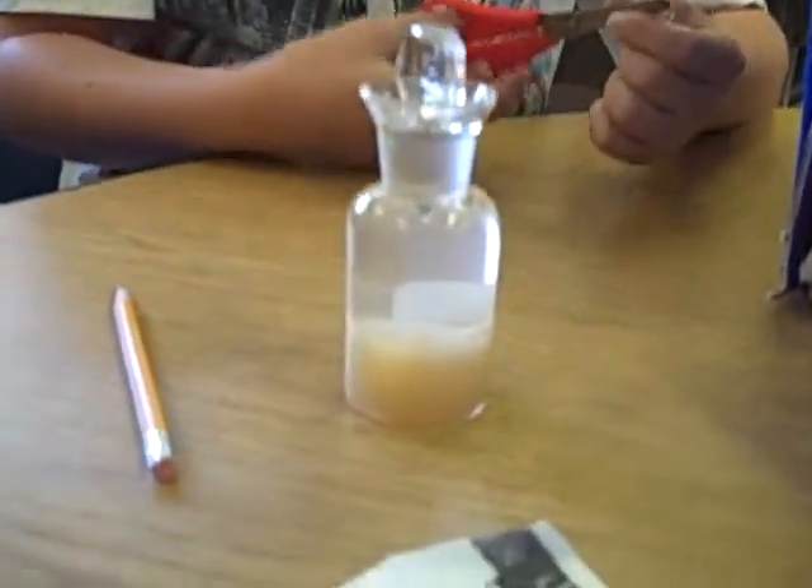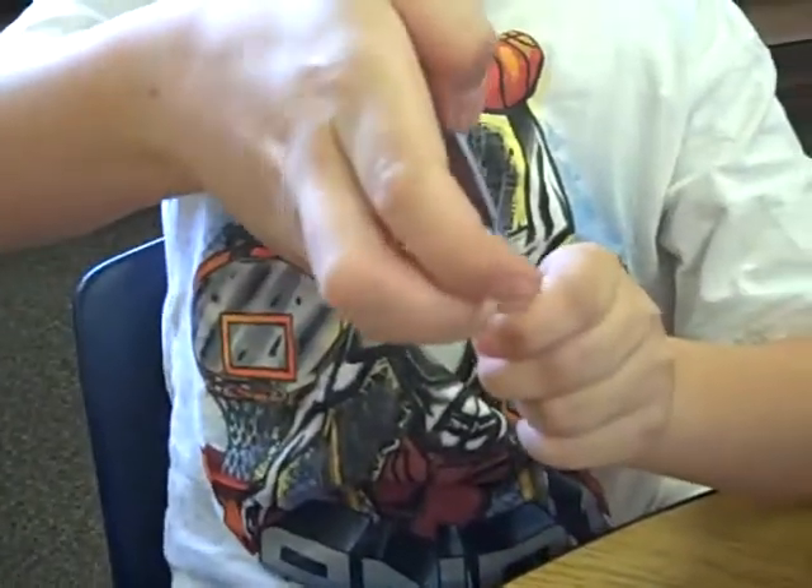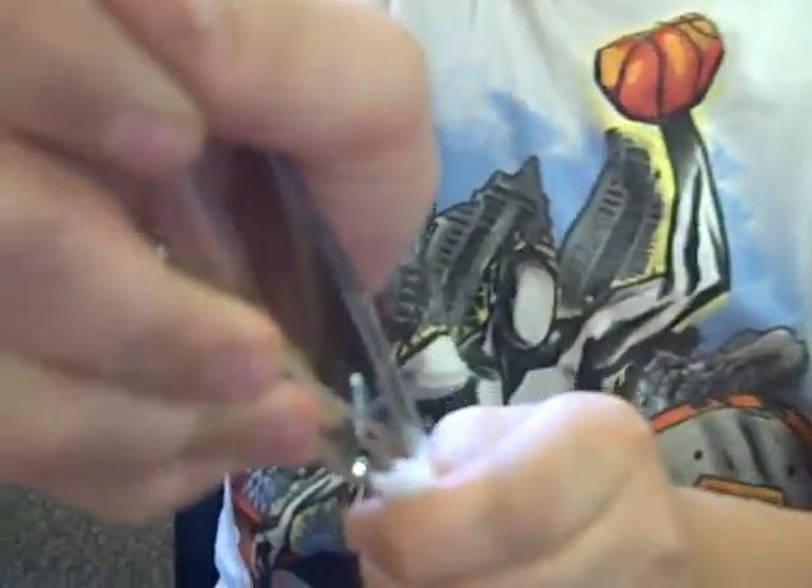We shake it again, let it settle, and now we're adding powder number three. I'm pouring in powder number three.